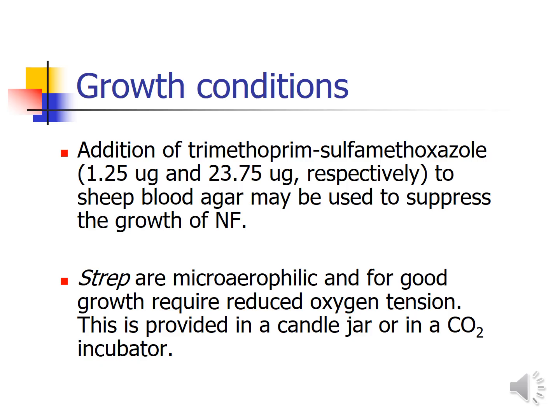Streptococci are microaerophilic and require reduced oxygen tension. This is provided in a candle jar or in a carbon dioxide incubator. So you can grow them in an environment with less oxygen, for example in a candle jar or a carbon dioxide incubator. This is explained in this paragraph. Fine. Next.